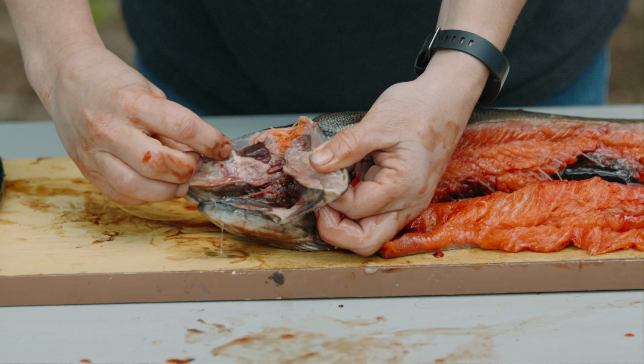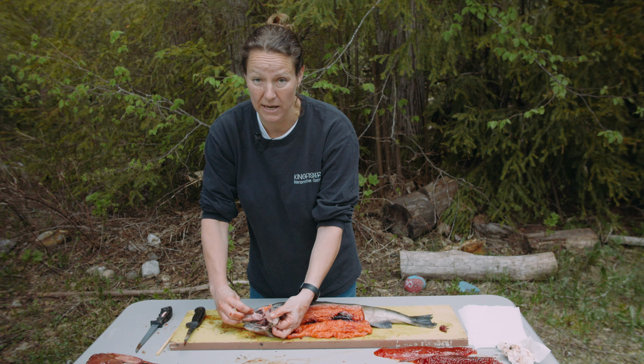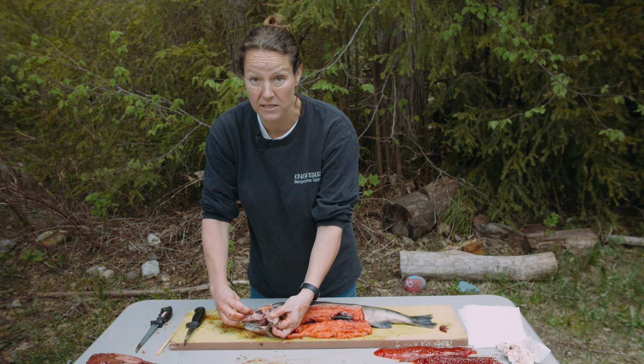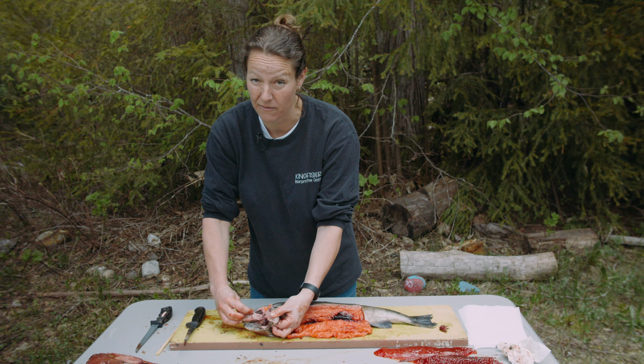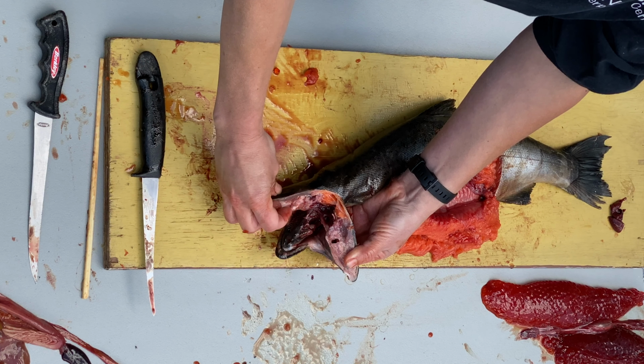So it's a little gooey because this fish has been frozen. If this was a fresh fish, the brain would be more solid than it is. So it's liquefied due to freezing. All right, so it's just that tiny little piece of white right there.